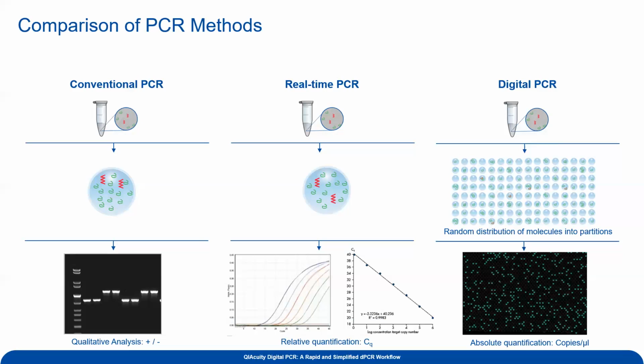Or you have something like SYBR Green I or EvaGreen, which basically just bind to all double-stranded DNA as it's produced in the biochemical reaction of PCR. So ultimately what this gives us though is a rise in fluorescence over a run in time where time is expressed as a cycle, right? And you can see different amounts of starting input template will rise at different times throughout your thermal cycling process. So the earlier they rise, so the smaller that cycle number is, the more concentrated your starting material is. The later they rise, the less concentrated it is.